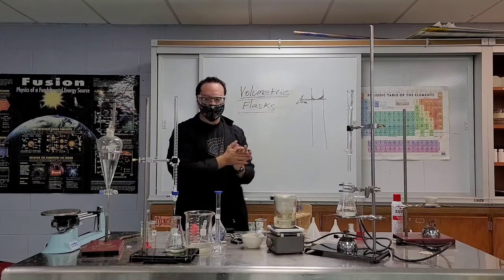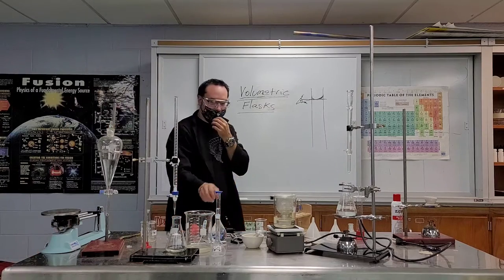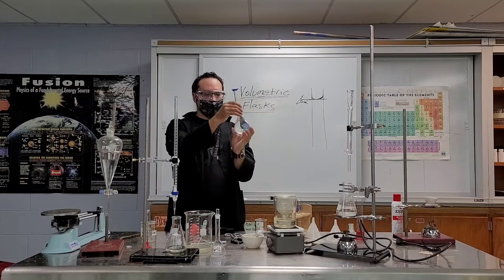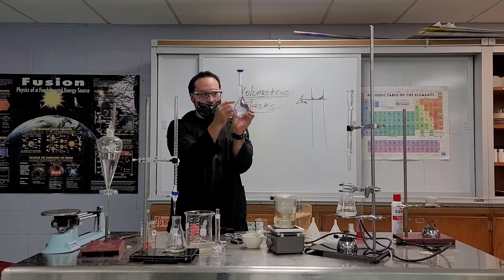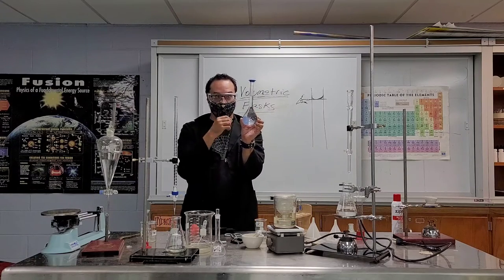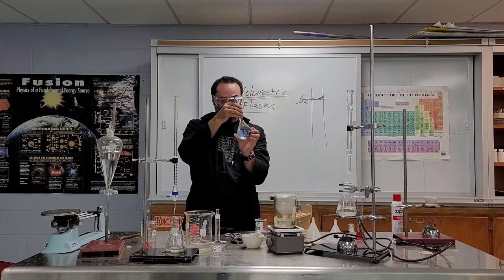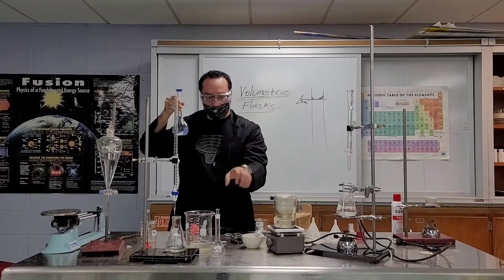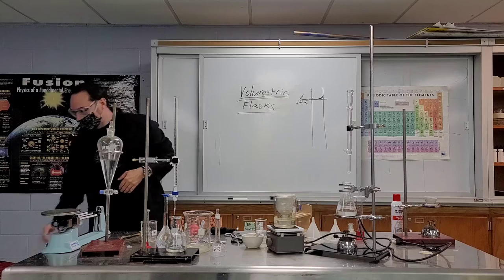So that's how you use a volumetric flask. Again, volumetric flasks are for making very accurate volumes of a mixture. There's only one line because they're made very precisely. These are much more expensive than a beaker or a flask.